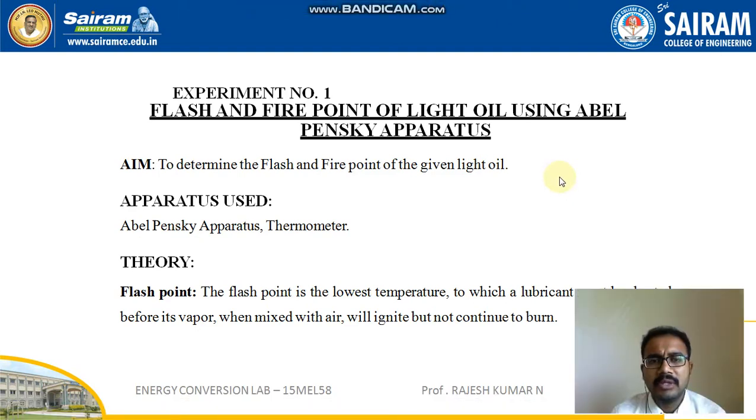Hello everyone. In this video, we will be discussing the theoretical procedure for flash and fire point of light oil using an Abel Pensky apparatus. We already discussed the working procedure and how to take the readings in the earlier video, so in this one we will be just discussing the theory part. What is the aim of this experiment? In this experiment, we will be determining the flash and fire point of the given light oil.